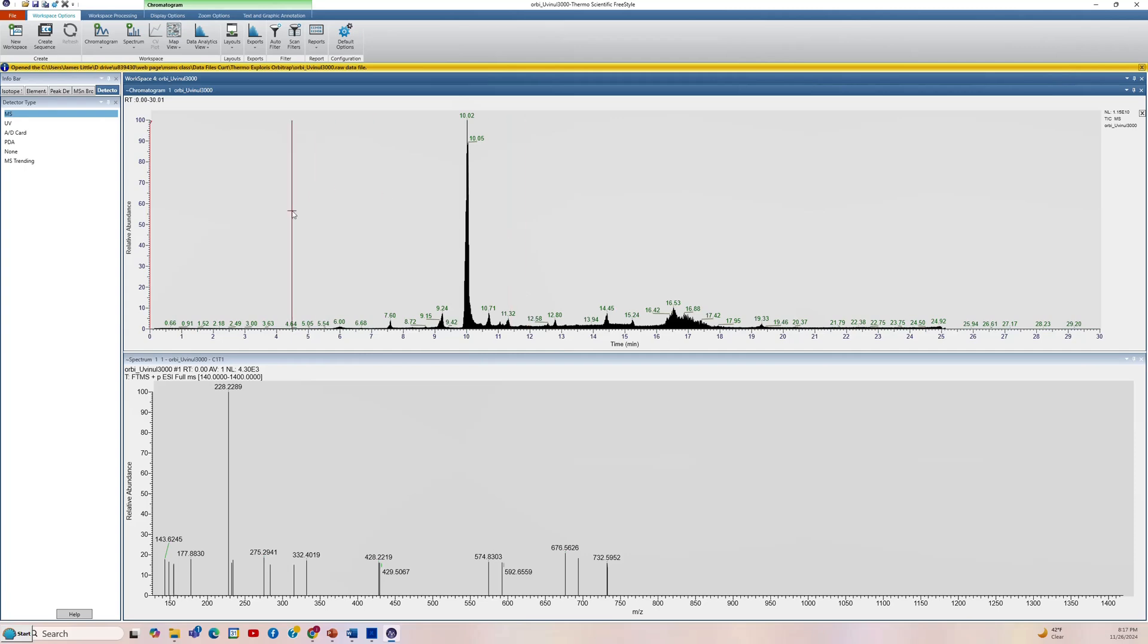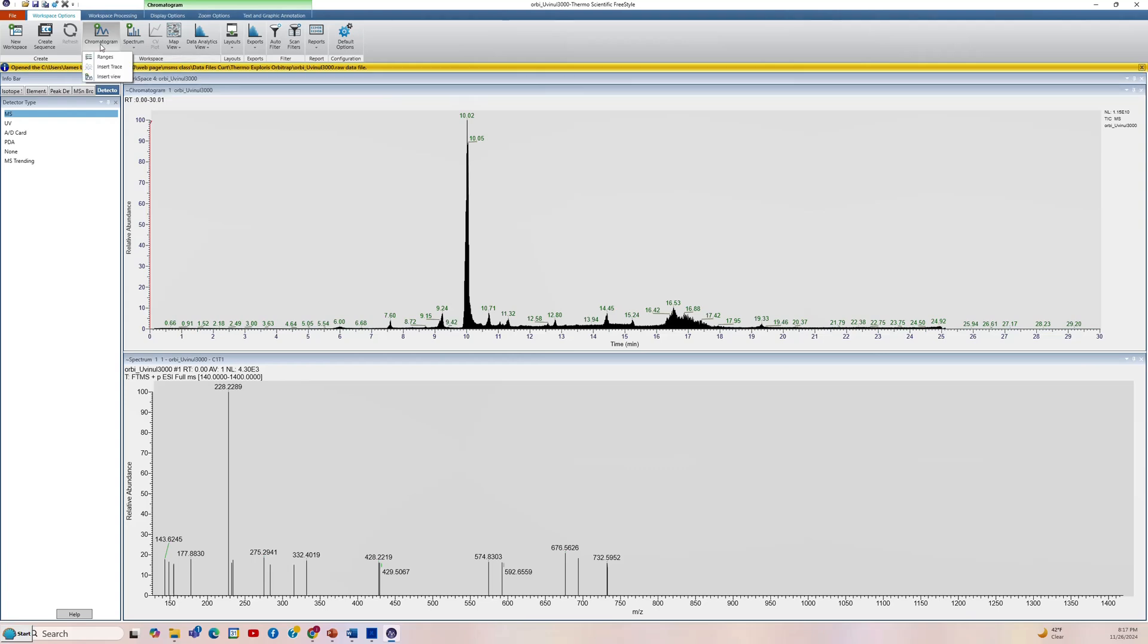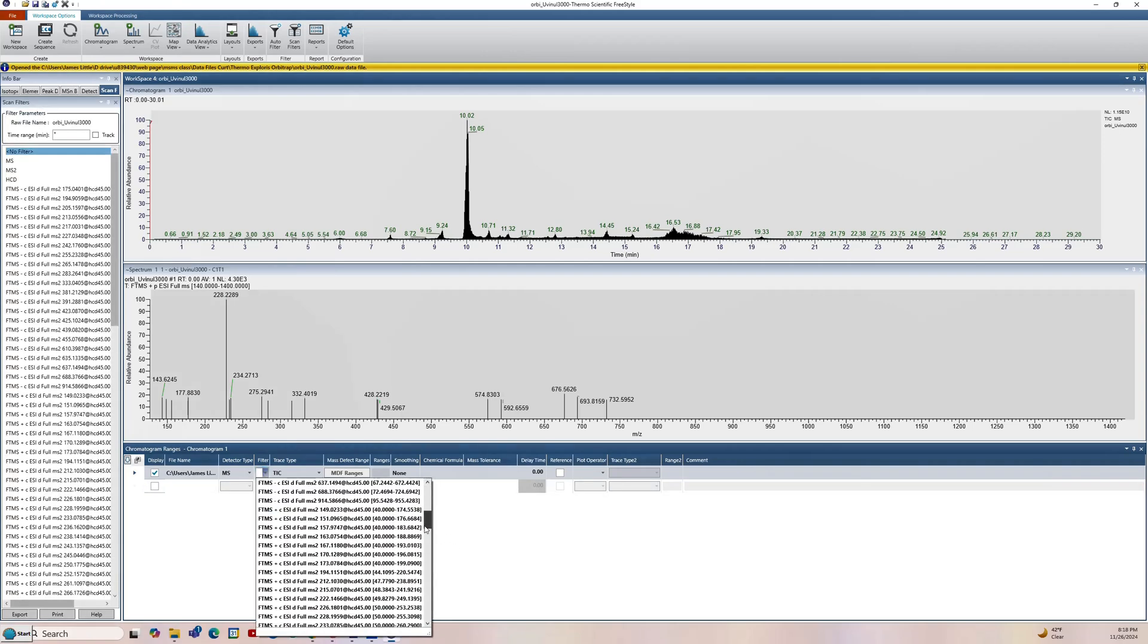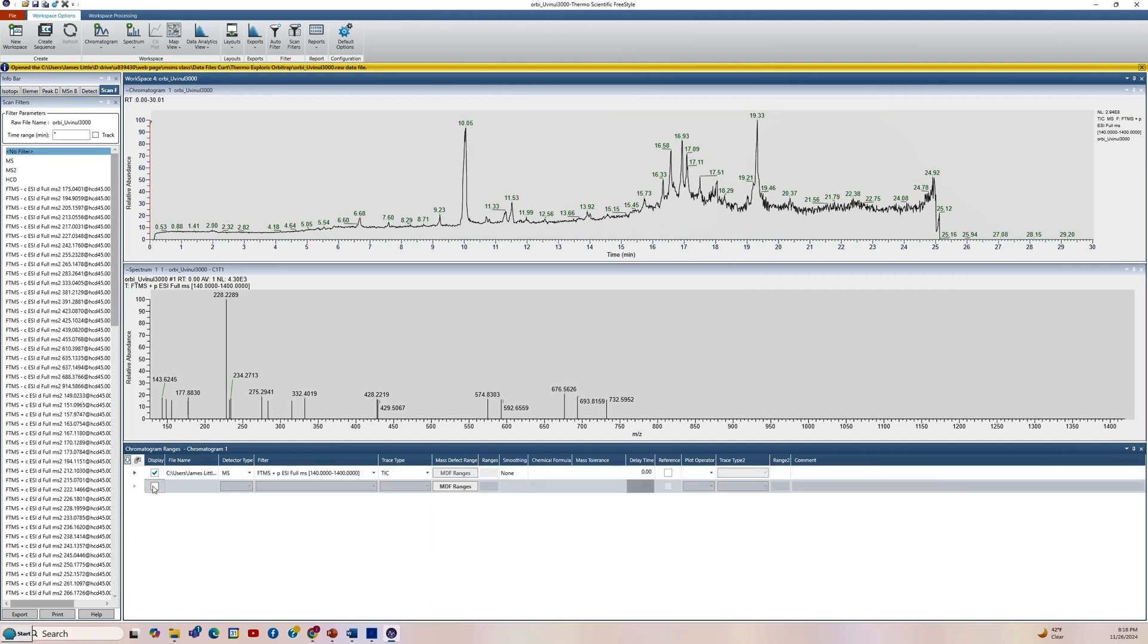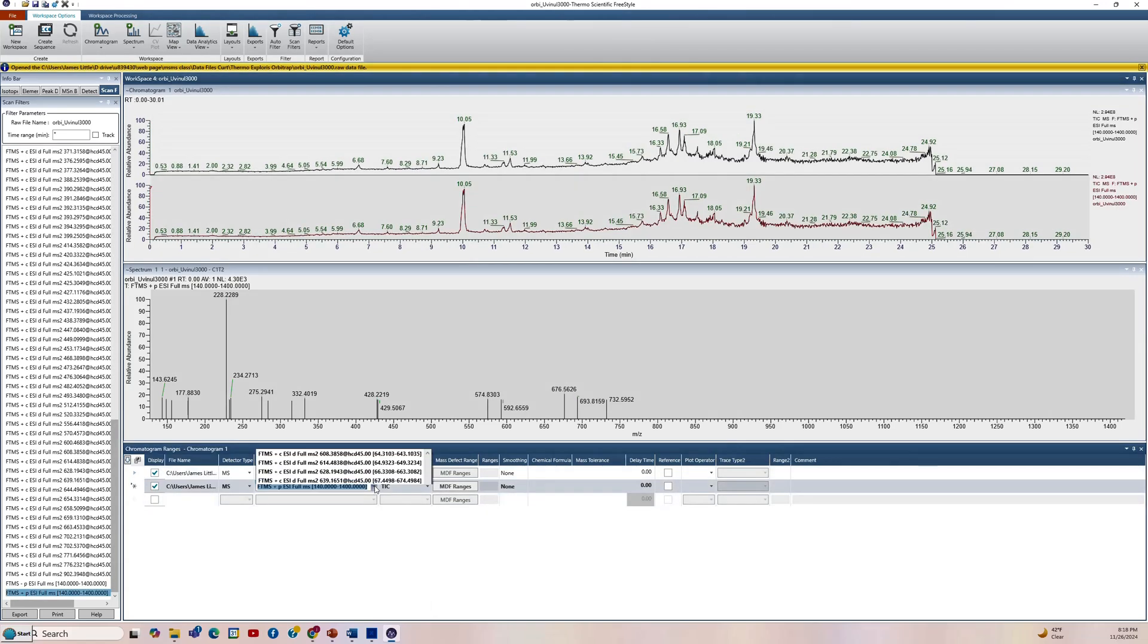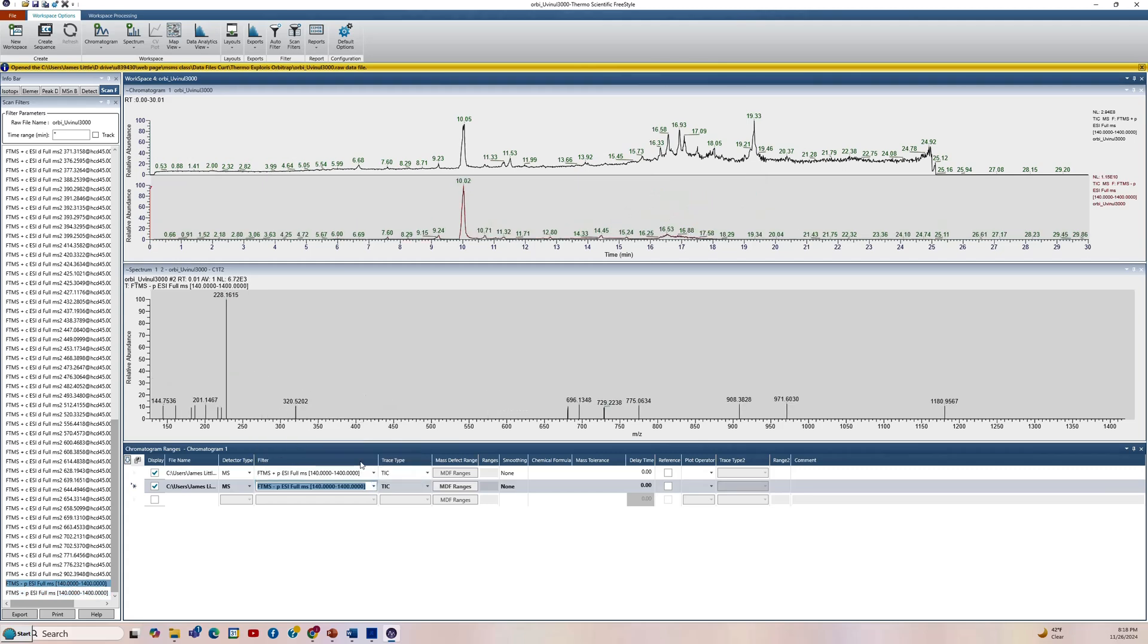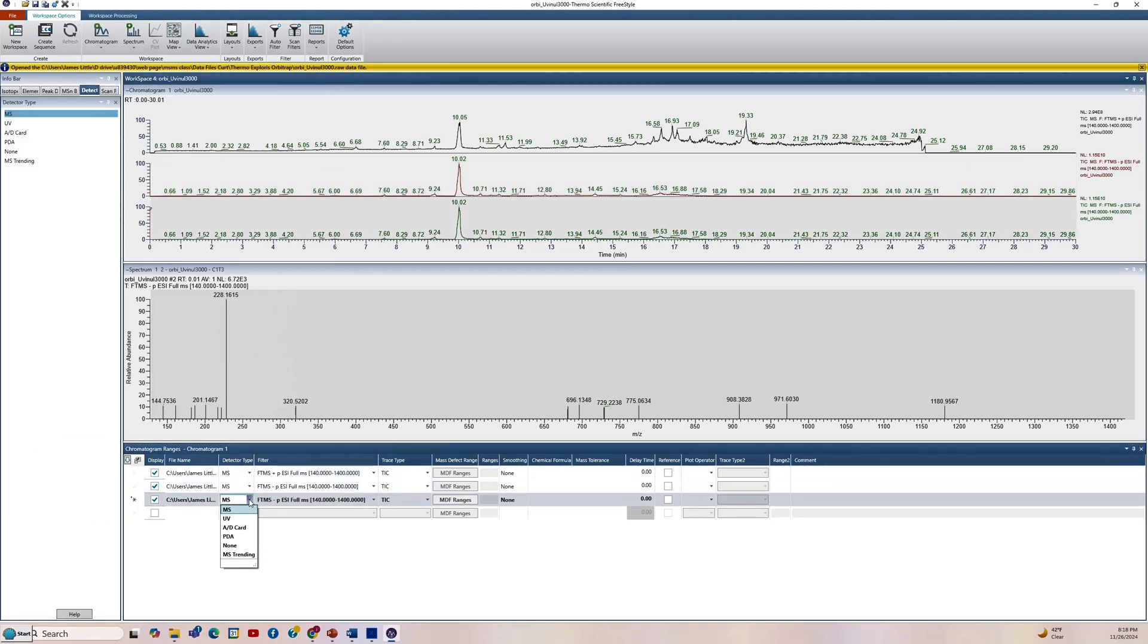So the first thing we'll do is we'll go up to the top here to the workspace options and go to chromatogram and create ranges. This opens another window at the bottom where we'll first go to the filter. And the trace that we're looking for is all the way to the bottom. This is the total ion trace for the MS for the positive. And so we'll put it on the top. We'll add another range here. Again, we'll go this time to the bottom again, all the way to the bottom. And then open the negative ion. So that'll be our second trace. Let's add one more trace, which will be our detector type, which will open the PDA.